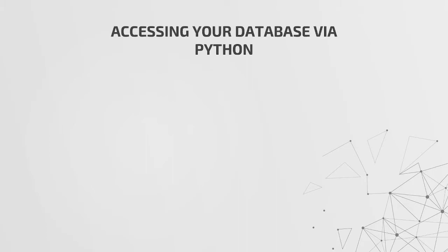Now let's look at how to access the database via Python. Now, I should point out that in the last few weeks, we've been talking about writing modules, like an importer module or a DRS module. In this case, we're not really doing that.